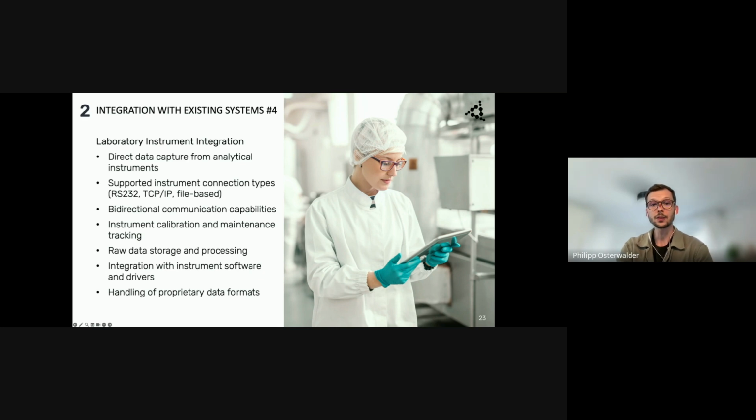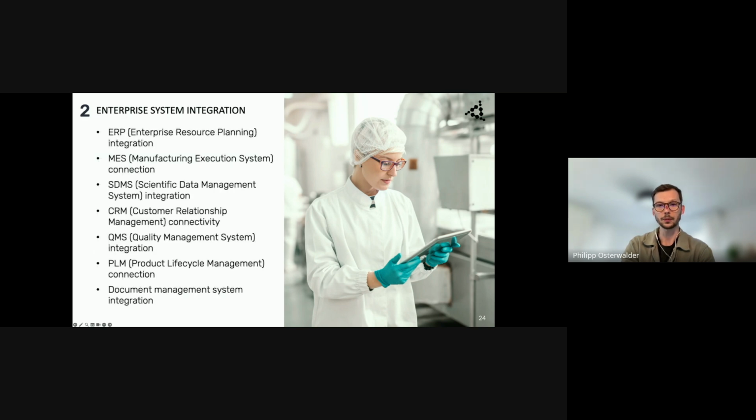Beyond instruments, a LIMS often ties into high-level systems like ERP or QMS platforms. This alignment ensures that data from the lab informs broader business operations, whether it is inventory control, billing, or customer relationship management. A well-integrated LIMS not only improves lab efficiency, but also benefits the entire organizational ecosystem.